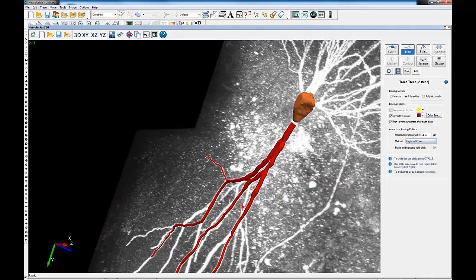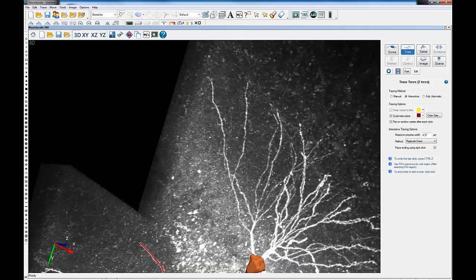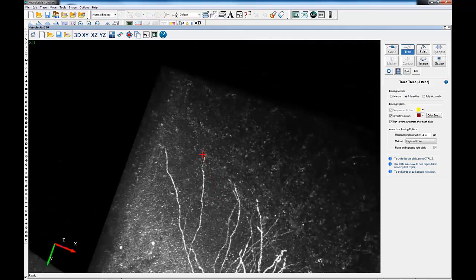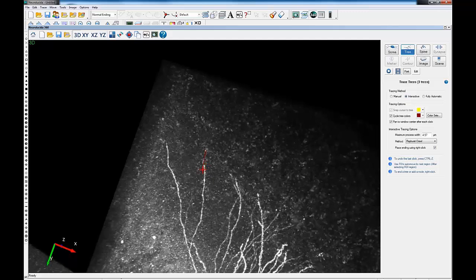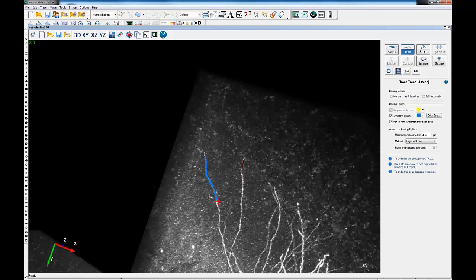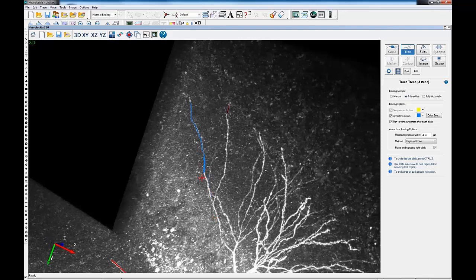You can switch between the algorithms at will. You don't have to reconstruct using the same method, and those methods are really just designed to give a different amount of weight to determining what's signal and what's noise. So what's the branch and what's not. You'll find that the different algorithms perform differently on the different types of image data.